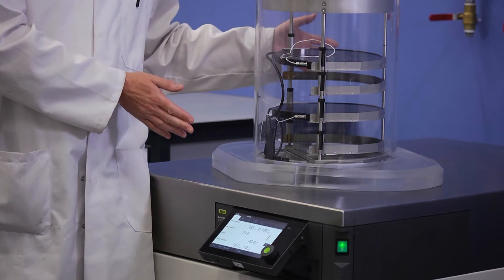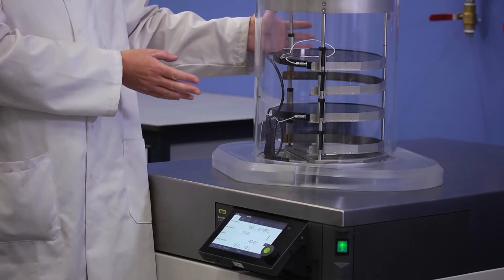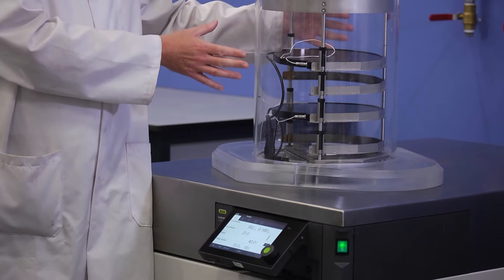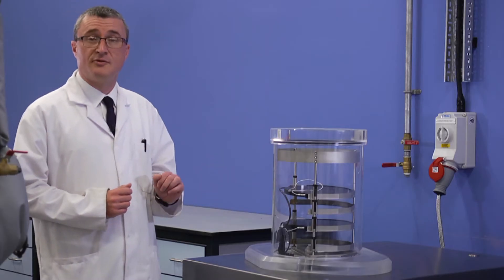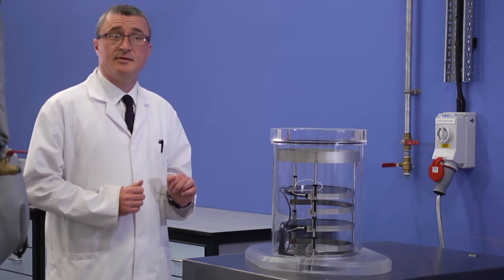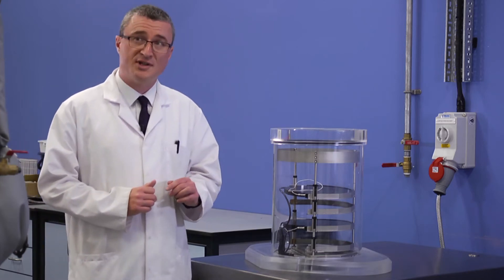This is the Buki Lio Vapor L300. As you can see, it's a robust piece of equipment. It has a variety of different drying chambers and manifolds available according to requirements.